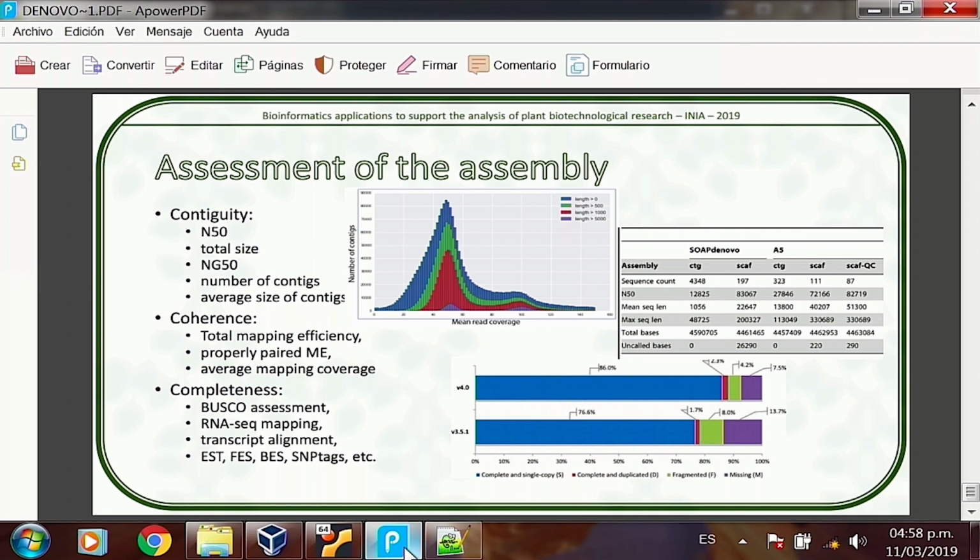It is merely a computational or an IT algorithm. It was just taken by the bioinformaticians in order to do this kind of analysis faster. Essentially, it just indexes a reference genome, and then uses this Burrows-Wheeler transform to actually do the search of these sequences, which are the FASTQ sequences that we have, as fast as possible. You can very easily align 10 million reads to a human genome in less than 1 hour, which you wouldn't be able to do using any other algorithm.